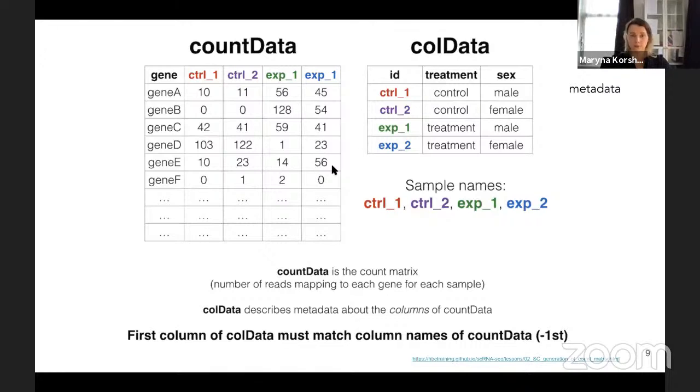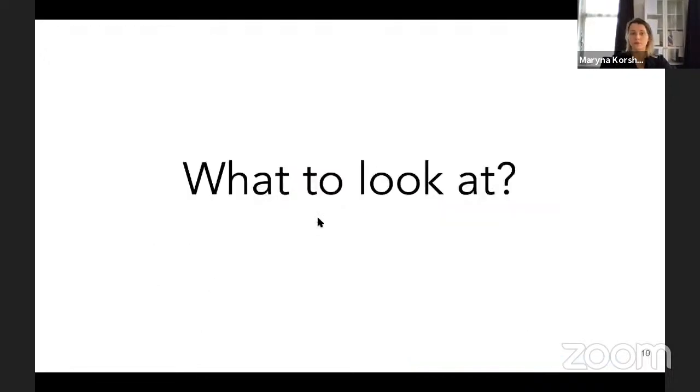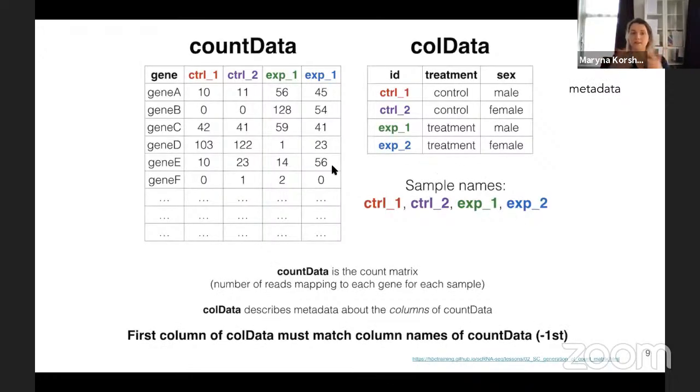Depending on the pipeline, and quite often used is Drop-seq tools if you talk about Drop-seq analysis, or Cell Ranger if it is a 10x experiment, you receive a slightly different representation of the count matrix, as I said. Here is the one most widely used for Drop-seq tools. However, as far as I know, for Cell Ranger you have just a matrix, and all of the information about cells and genes is stored in other tables. Then when you're doing the data loading, you merge this information, and as a first output, you actually make this lovely table.